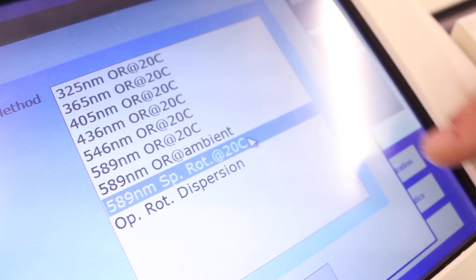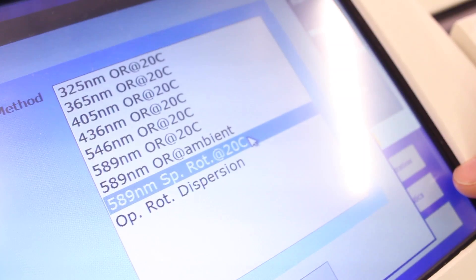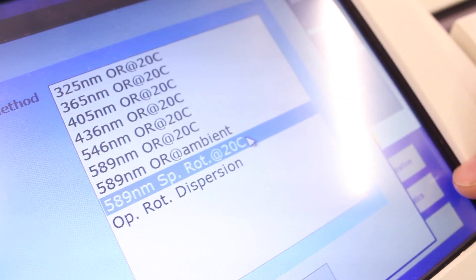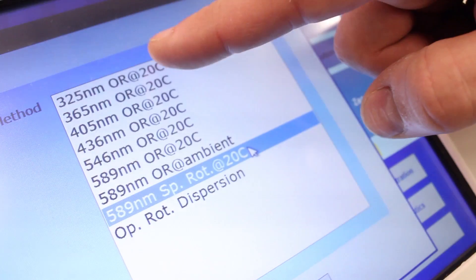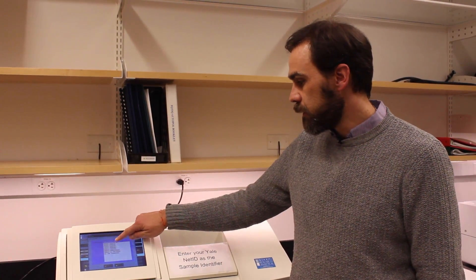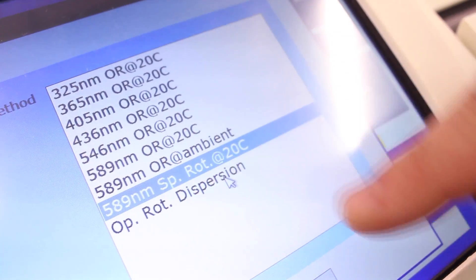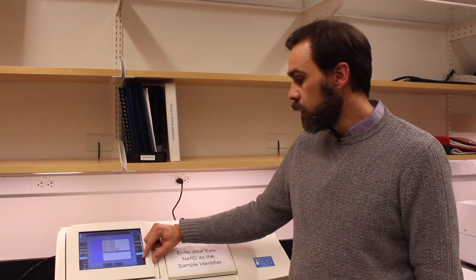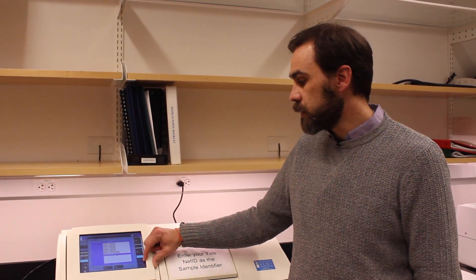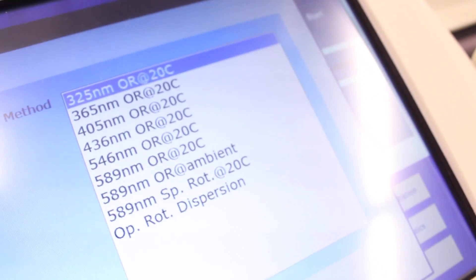You can also have the instrument calculate the specific rotation for you by using one of the specific rotation methods. In this case, the instrument will prompt you for the sample concentration. In addition to the standard 589 nanometer wavelength, there are other wavelengths available to measure optical rotation. There's also the optical rotary dispersion method, which measures the optical rotation as a function of wavelength using all available wavelengths and collects the data in a table. If you need a new or different method, please talk to CBIC staff and we can help you create it.